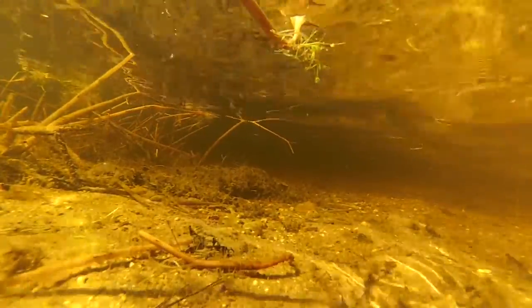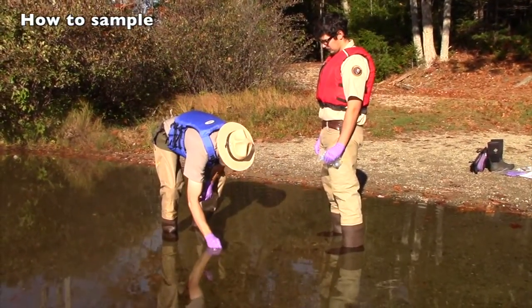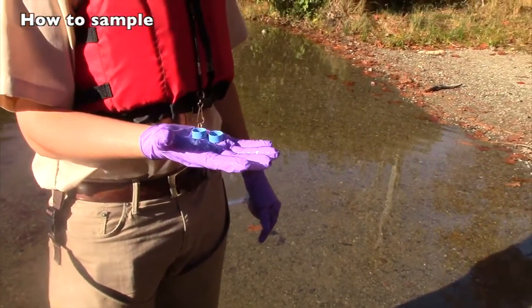If someone wades right in before collecting their sample, then the area will be disturbed. So move a bit upstream or wade far out enough to avoid the disturbed area, or return another day. This sampling procedure will take two people. Both put on purple nitrile gloves. One person will collect the sample. The other person will hand the sampler the end cap when the time comes and will hold open the sample bag.